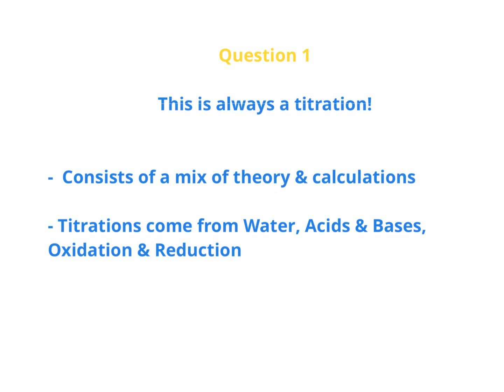When we're talking about theory here, we're talking about theory specifically related to the experiment, but we're also talking about titration technique. So that could refer to the preparation of any piece of equipment, such as a burette, a pipette, or a volumetric flask. It will also maybe look for indicators, and you may also be asked for colour changes.